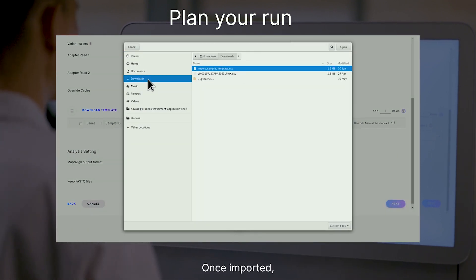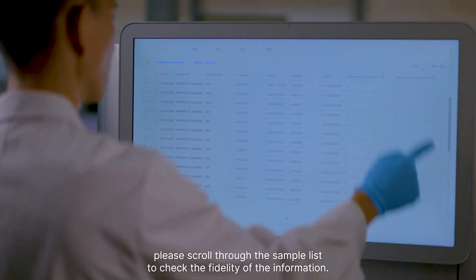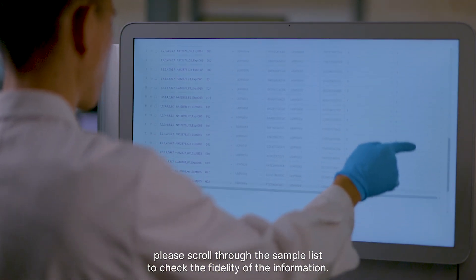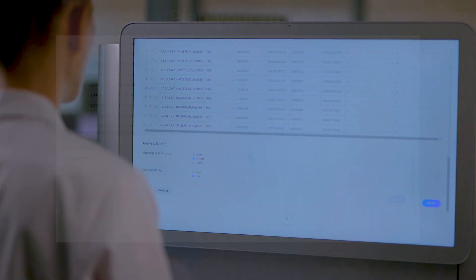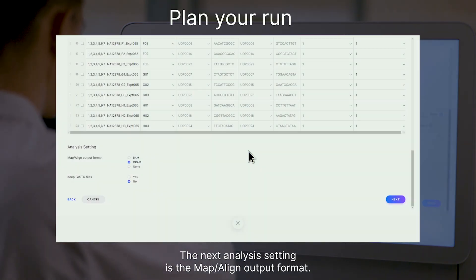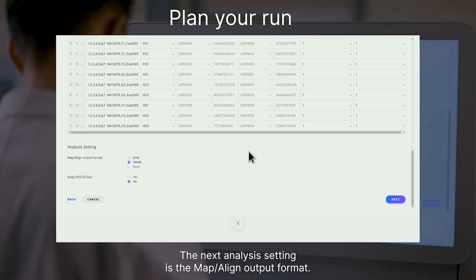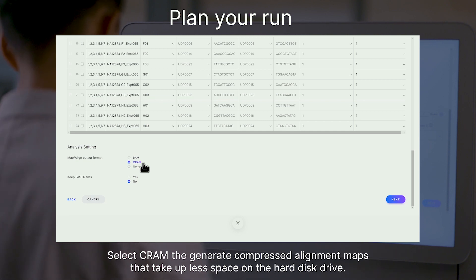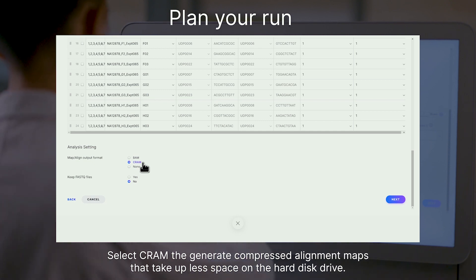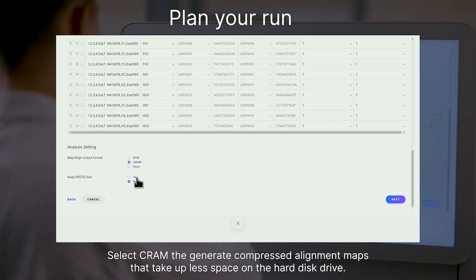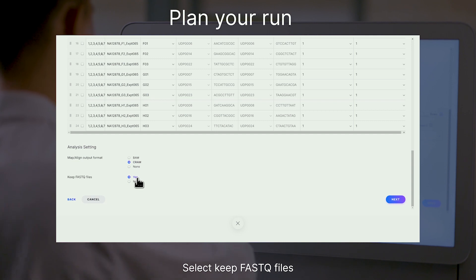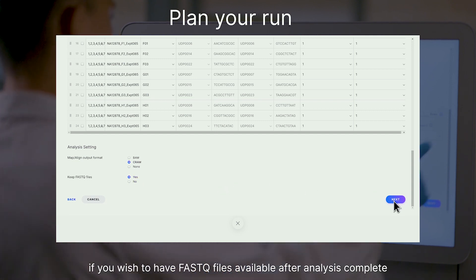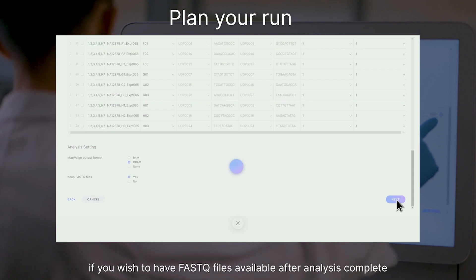Open up the template with your favourite spreadsheet editor, then upload the completed sample list by clicking on the Import Samples button. Once imported, please scroll through the sample list to check the fidelity of the information. The next analysis setting is the Map Align Output Format. Select CRAM to generate compressed alignment maps that take up less space on the hard disk drive. Select Keep FastQ Files if you wish to have FastQ files available after analysis is complete.